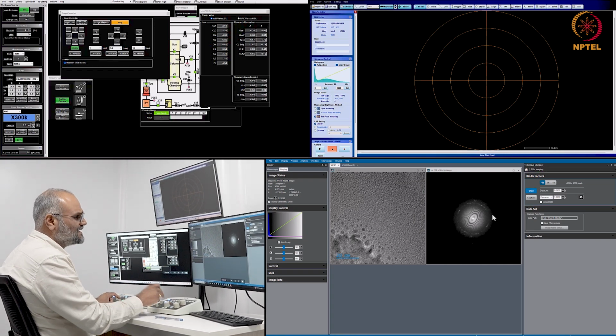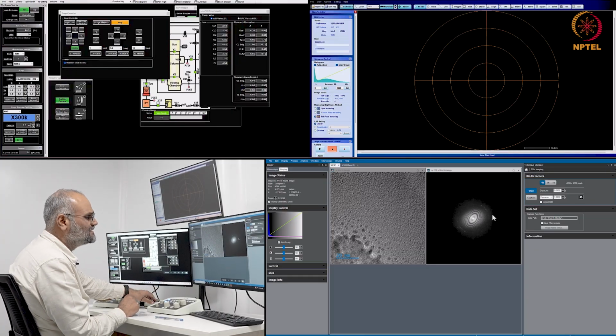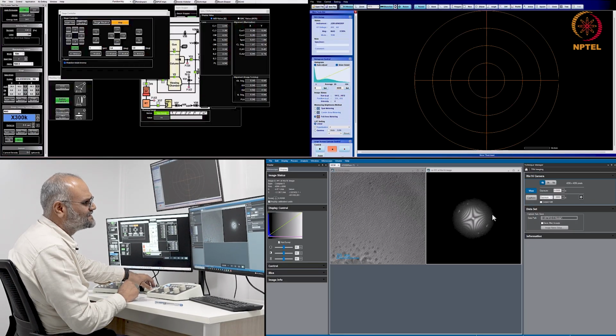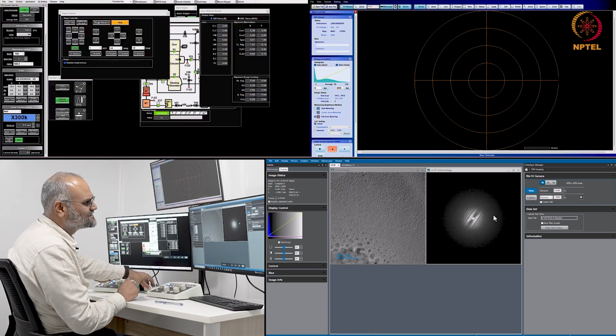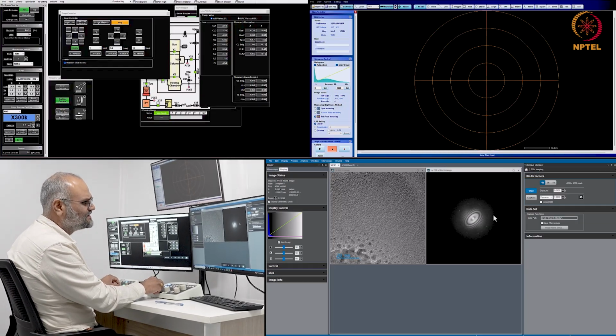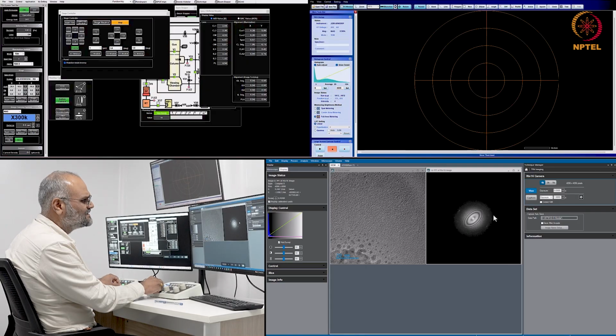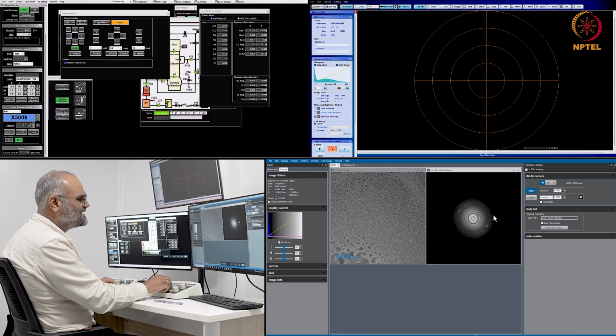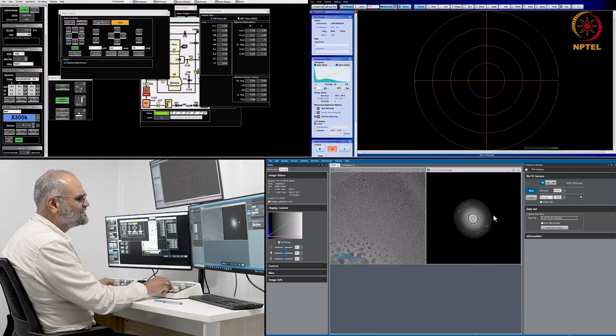As you can see, if I bring this to the right height, the diffractogram here becomes sort of oval shaped, and this is due to the astigmatism. Let me correct this coarsely with this coil and make it as symmetric as possible. You can see that it's becoming more and more circular now, and I'll go to the zero focus and go on.